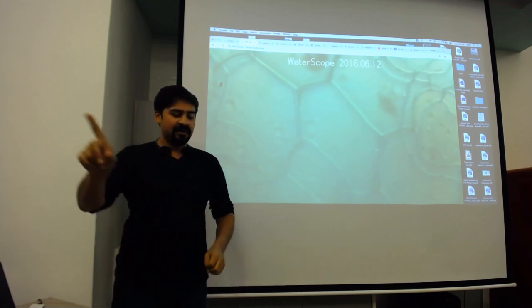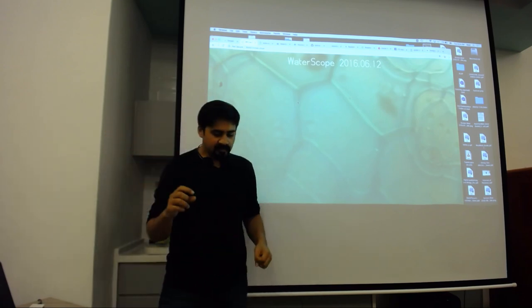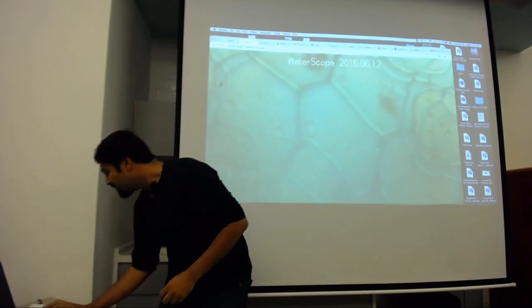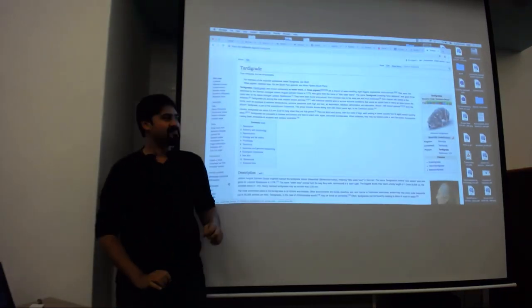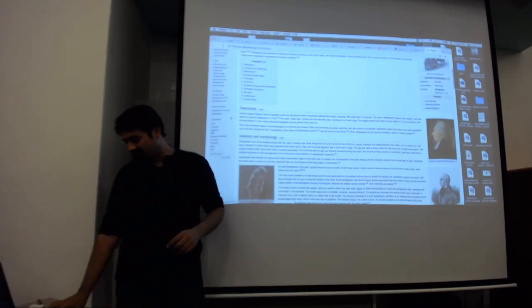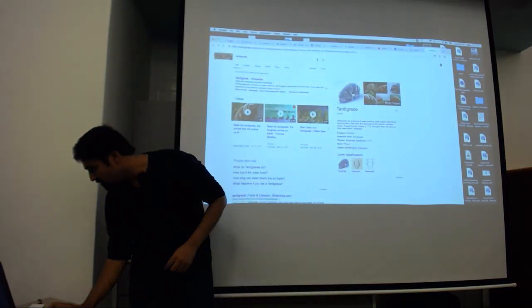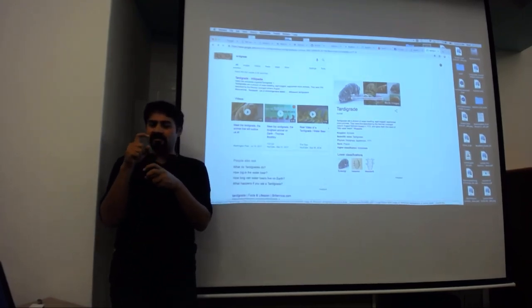Okay, excellent. Cool. One last thing before I am done bugging you with my voice. I am now looking for a tardigrade. So if anybody can help me find one, I would be most grateful. That's what a tardigrade is. It is a water bear. It is the most adorable thing ever. And I've been looking for it in water samples. Oh crap, I'm not connected to the internet anymore. I'm connected to the water. Okay, anyway. So look for YouTube videos and you will find a tiny little microscopic creature.